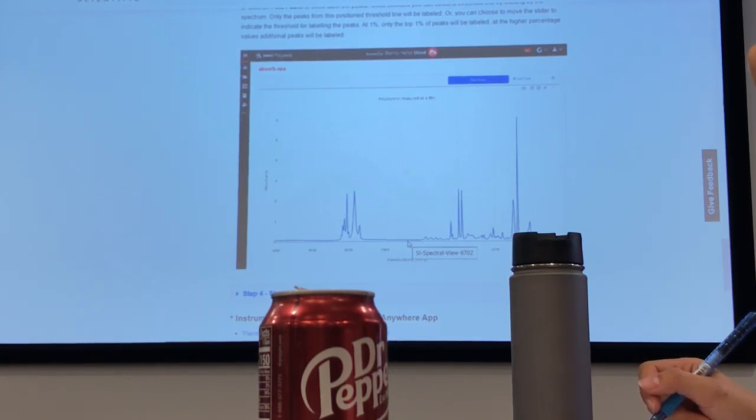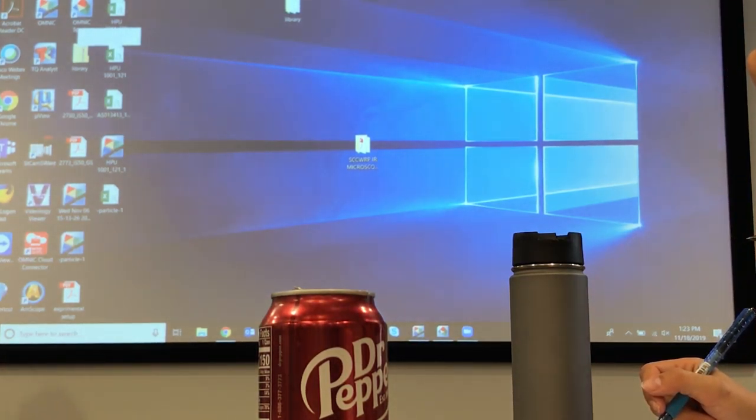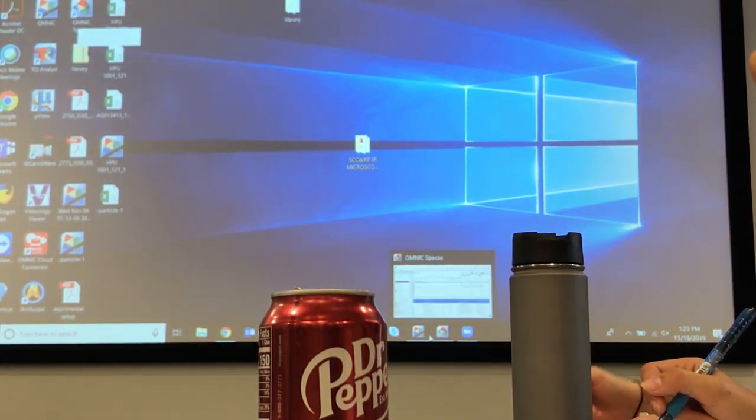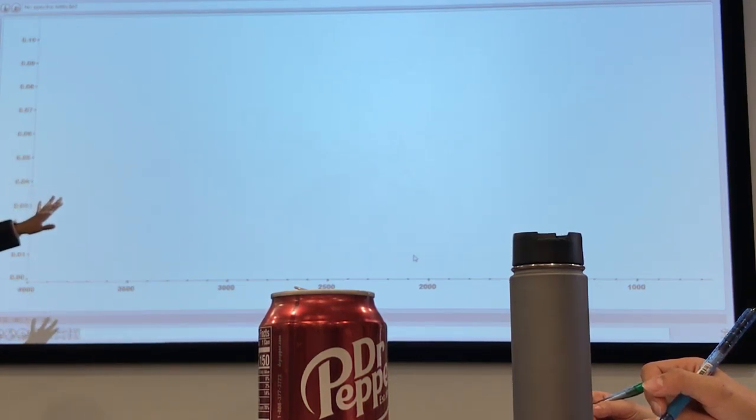This is actually made for students, like for universities, so that they don't have to take the instrument's time mainly to just process their data. So yeah, that's why I'm going over Omnic. The software that you will see tomorrow in the lab is called Picta, and it's basically exactly the same, but it has a visual view on top of it. That's the way you can image or see the spectra, see the images, see the maps and other things like that.